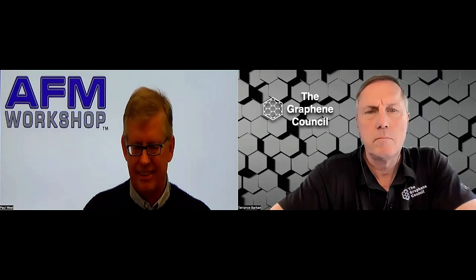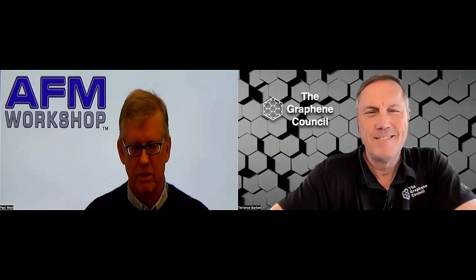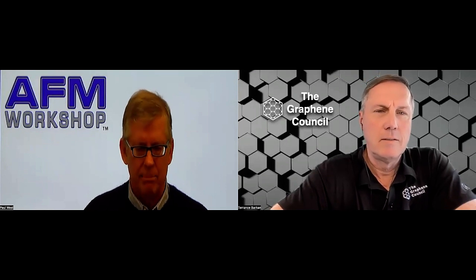Right. The thing is to get the focus of the measurement down to something that's relatively well understood. With atomic force microscopes, people come in with different things like elephant tusks and art from the Louvre, and ask what does this look like? What does that look like? And of course, if they start doing that with the microscope and they get the thing all out of alignment for the production application, then it could take some time. But if you use that microscope for production, you do the same thing every time. It's all programmatized. You're just trying to verify something. Yeah, it can go pretty quickly.